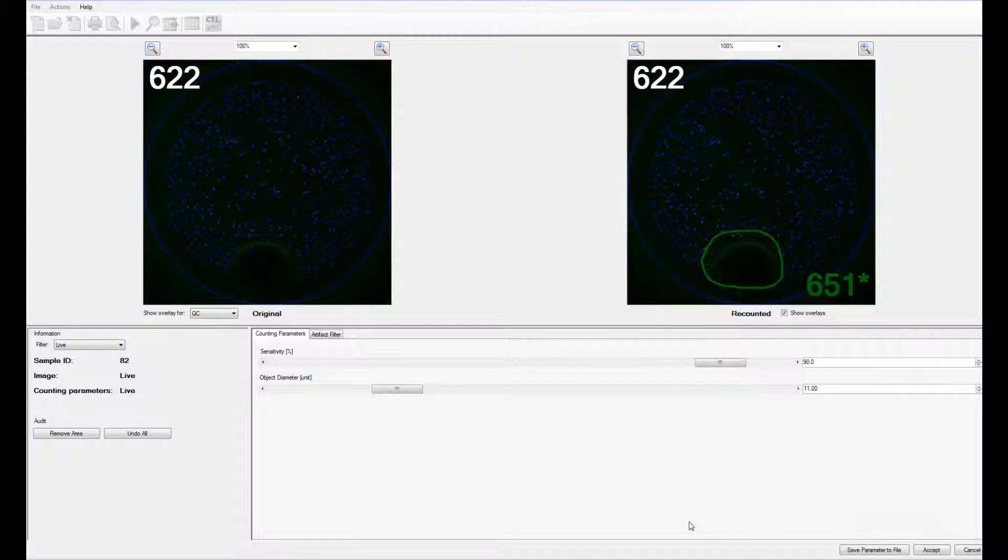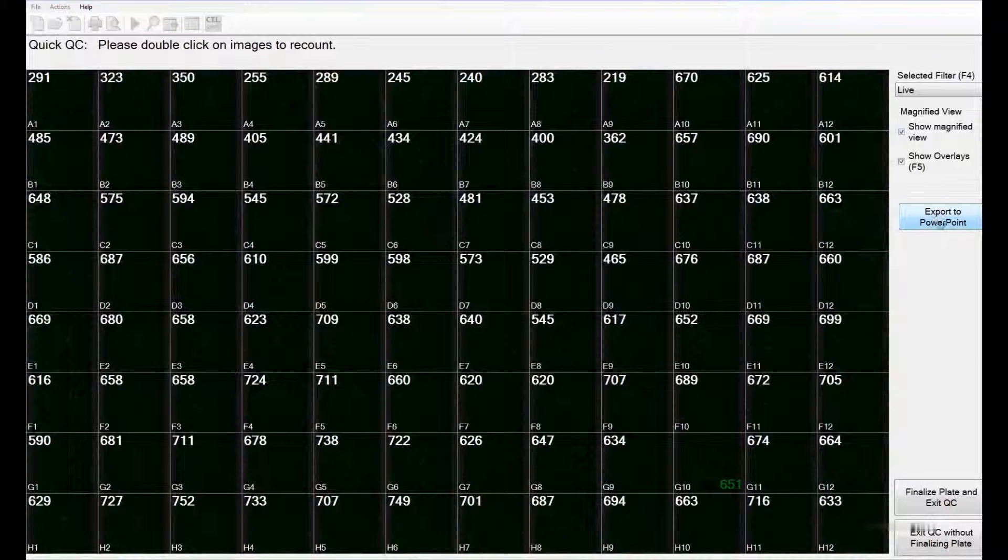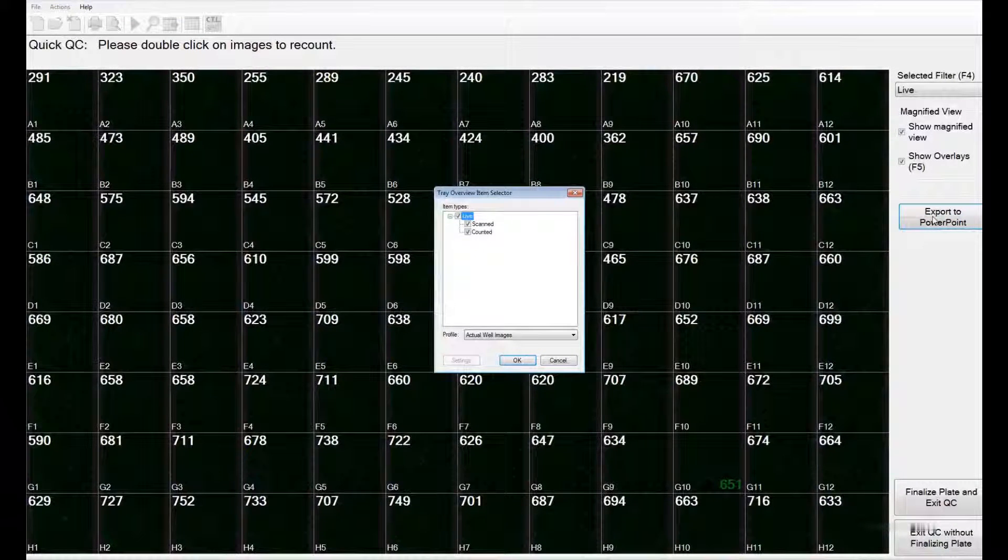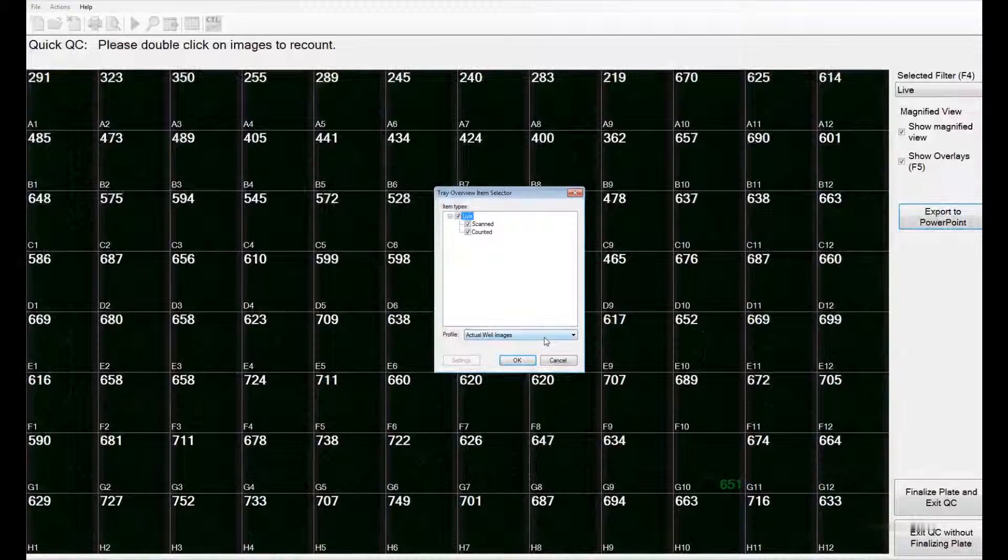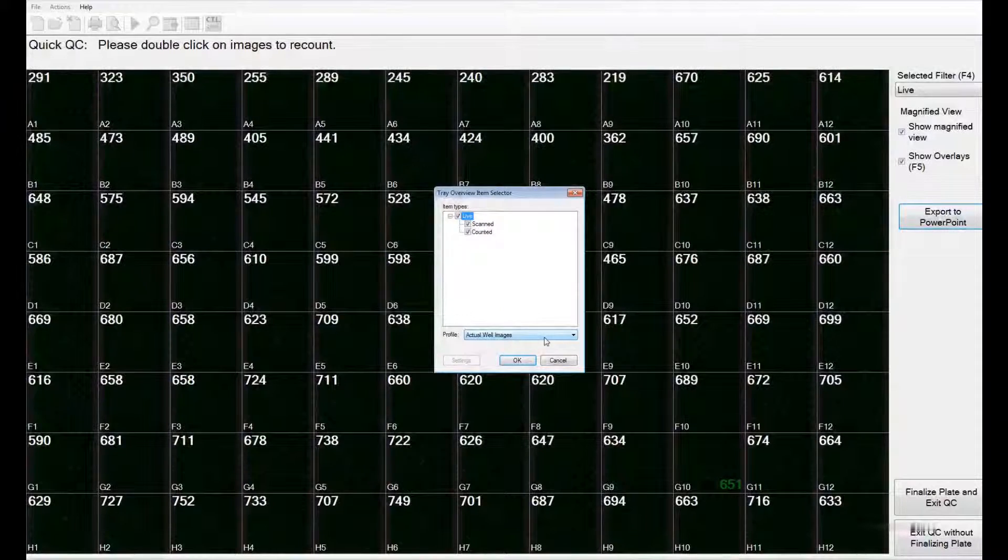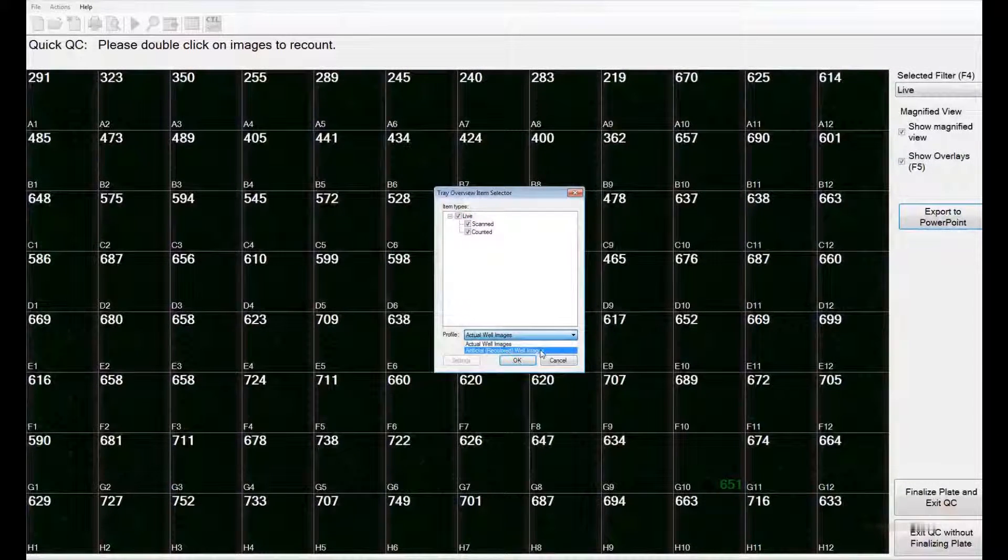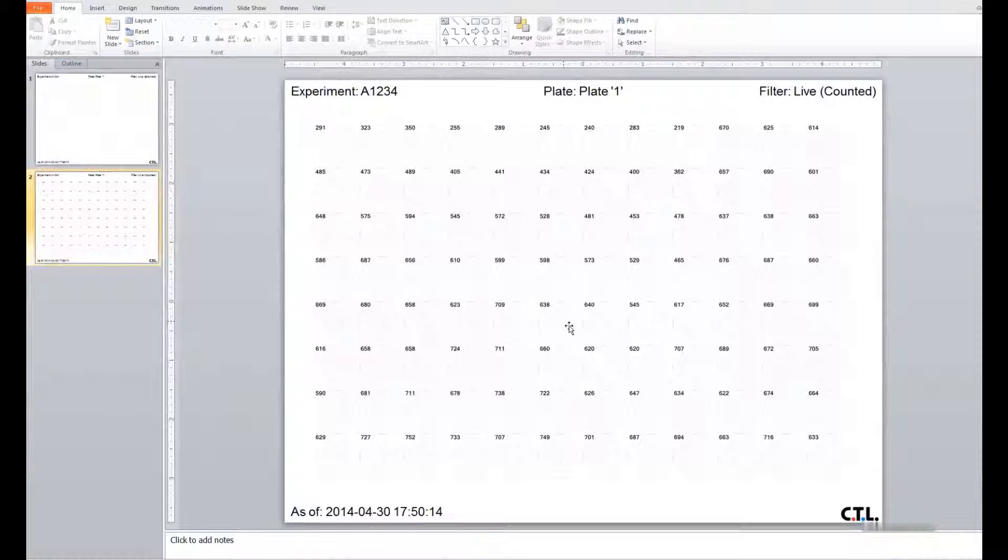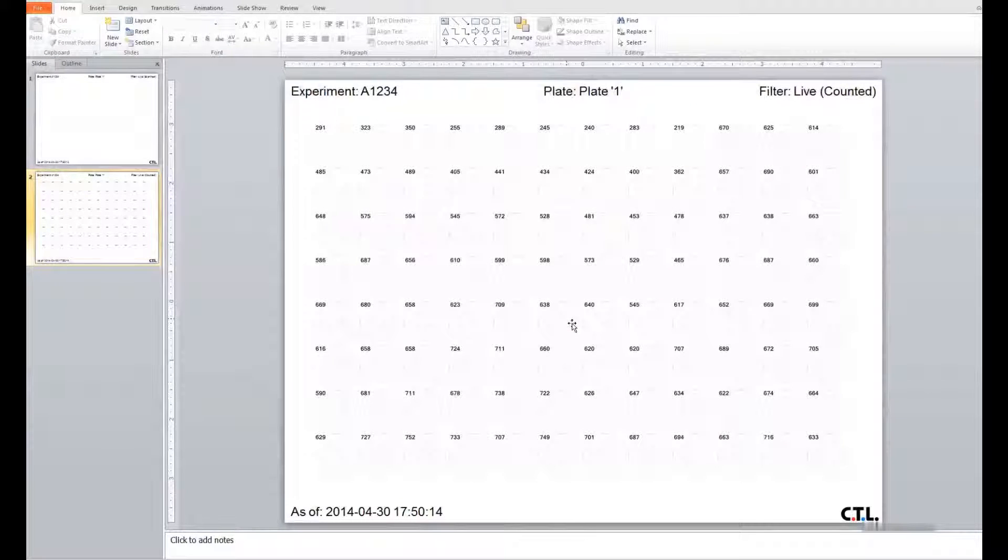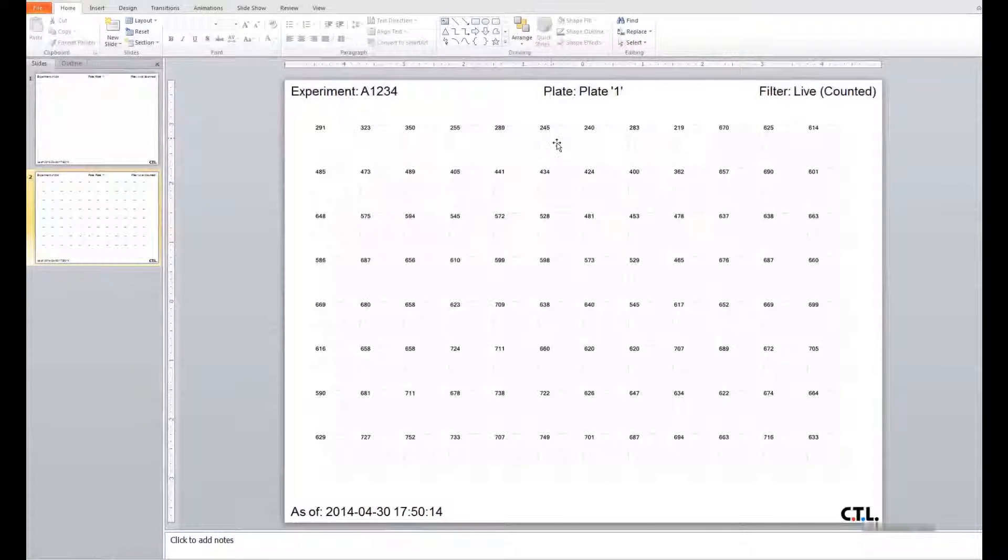If you are satisfied, you can click on accept. You can also export the entire plate results to a PowerPoint slide. The export can be as actual well images, dark background with green spots, or it can be exported in grayscale. The slides give an overview of the entire well and can be used for presentations or for documentation purposes. The counted values are also mentioned for each well.